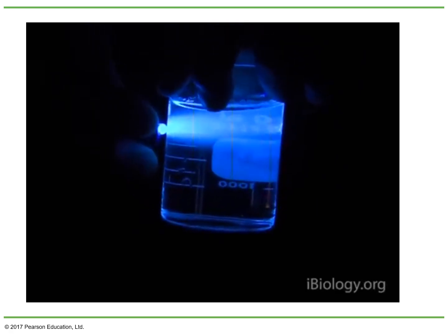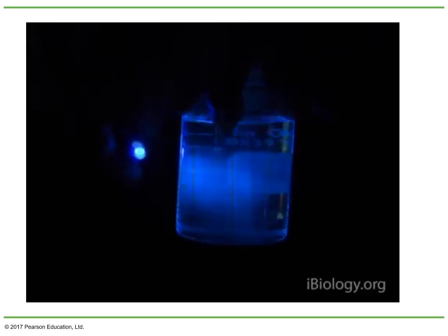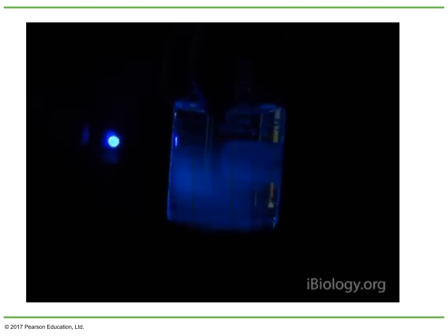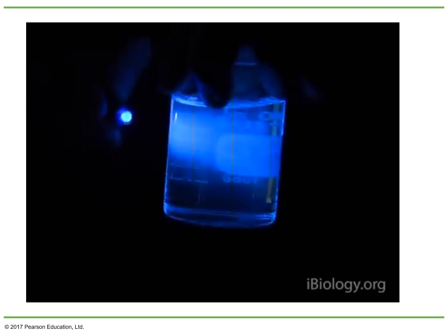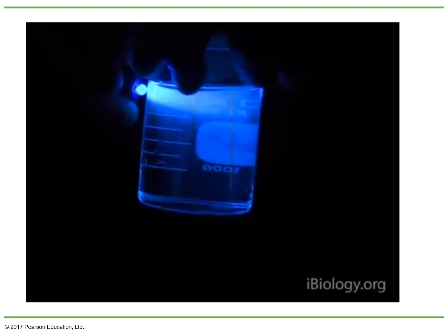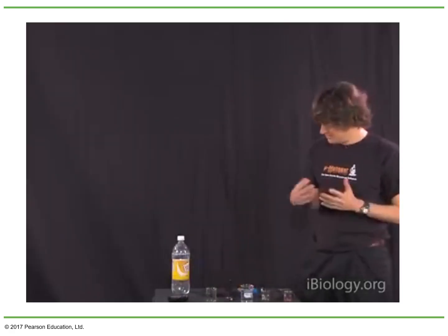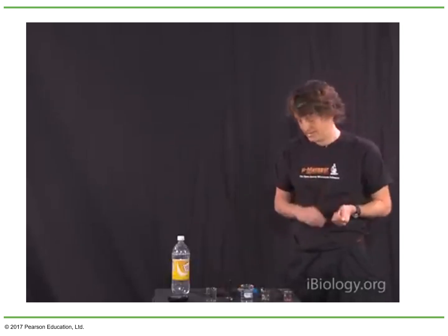It's another wavelength. It's a longer wavelength than this light with which I illuminate. And that's why we see it a lot better. Our eyes are not very sensitive to this UV, but they are highly sensitive to the blue light in the tonic water. Quinine is not the only compound that fluoresces, of course, otherwise it would be quite uninteresting.